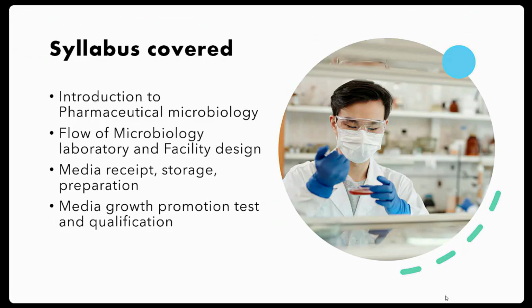Next, media receipt, storage, and preparation. Media is a growth medium required for microbial growth. We will procure the dehydrated media from the manufacturer and store it at room temperature. Some media require refrigeration, and we will store accordingly. We will prepare the media as per the manufacturer's instructions, adding the required amount of water and weighing the required amount of media. Everything will follow the manufacturer's instructions.